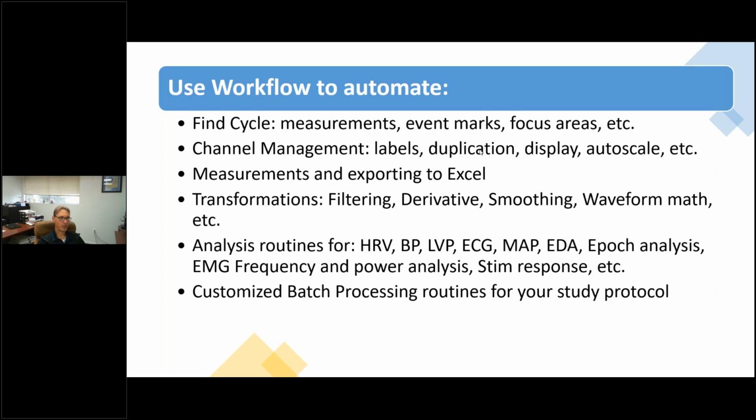You can take measurements using either the Find Cycle peak detector or using the epoch analysis module.